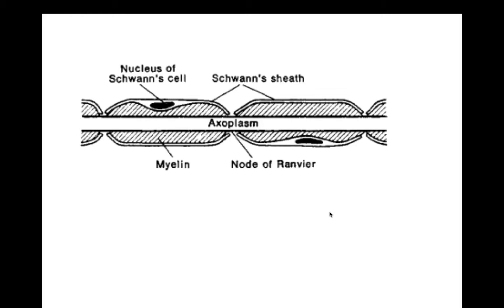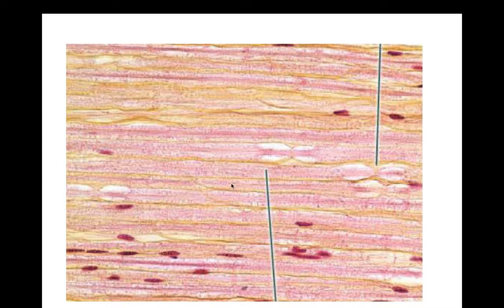Since we are in the PNS, who does the myelination? Schwann cells. Here's showing you the nucleus of one Schwann cell — remember one Schwann cell can only myelinate one section of one axon. Here is the Schwann cell, here is the myelin sheath (also called the Schwann's sheath). Where the two Schwann cells come together there's going to be a little gap — that is your node of Ranvier. Your axon or nerve fiber flows through here.